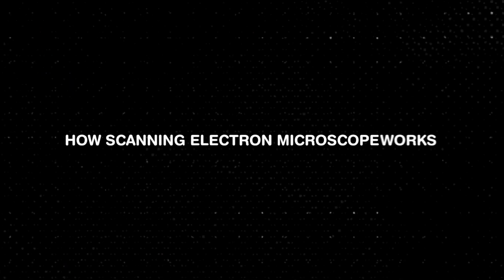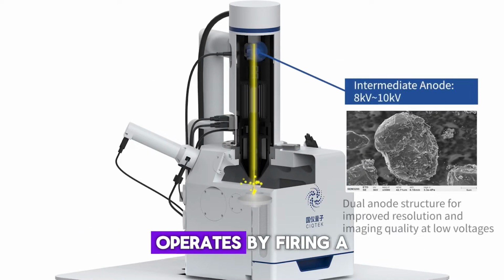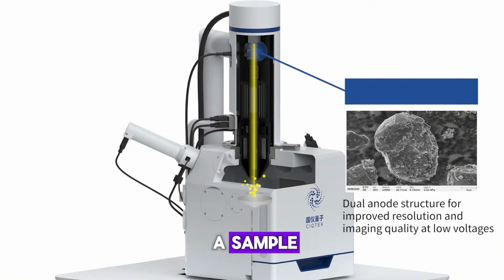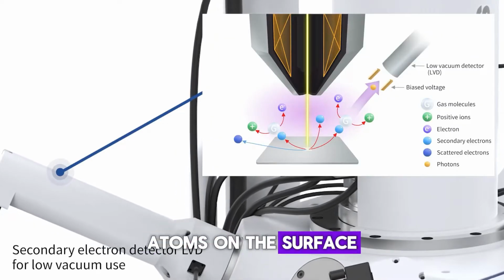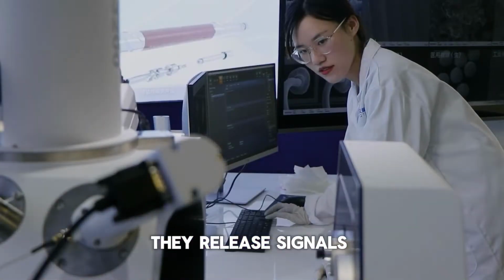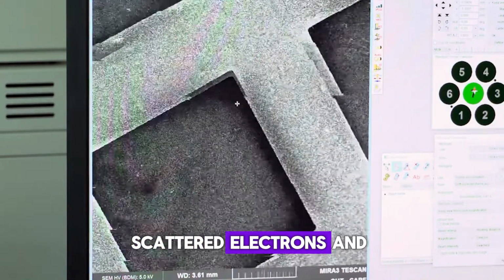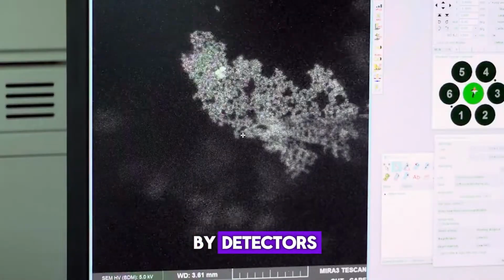How the Scanning Electron Microscope works. The Scanning Electron Microscope operates by firing a focused beam of electrons onto the surface of a sample. When these electrons interact with the atoms on the surface, they release signals, such as secondary electrons, backscattered electrons, and even X-rays, which are then captured by detectors.